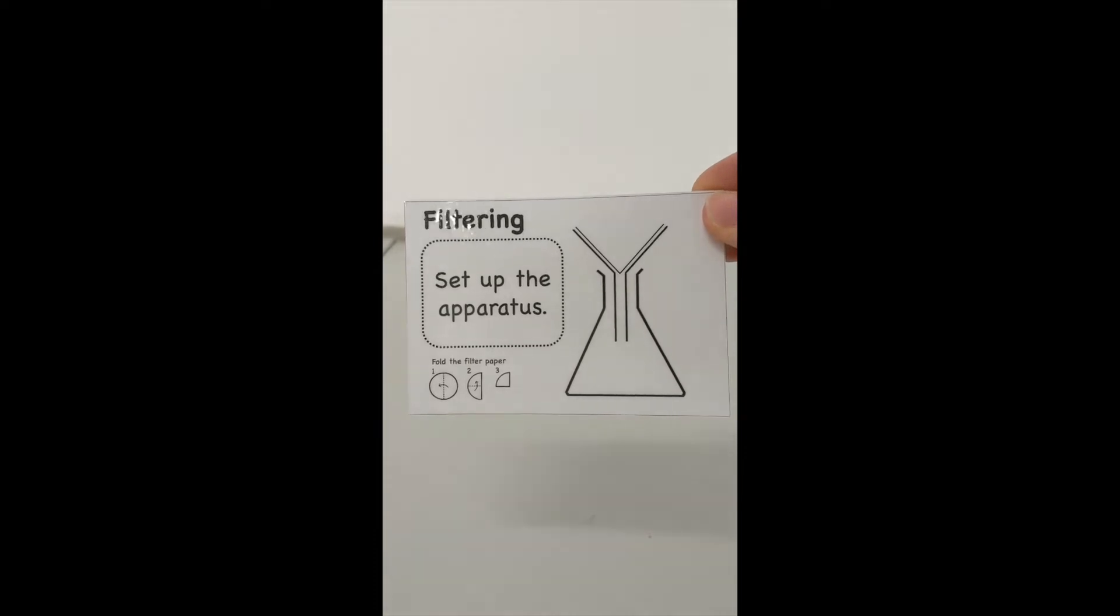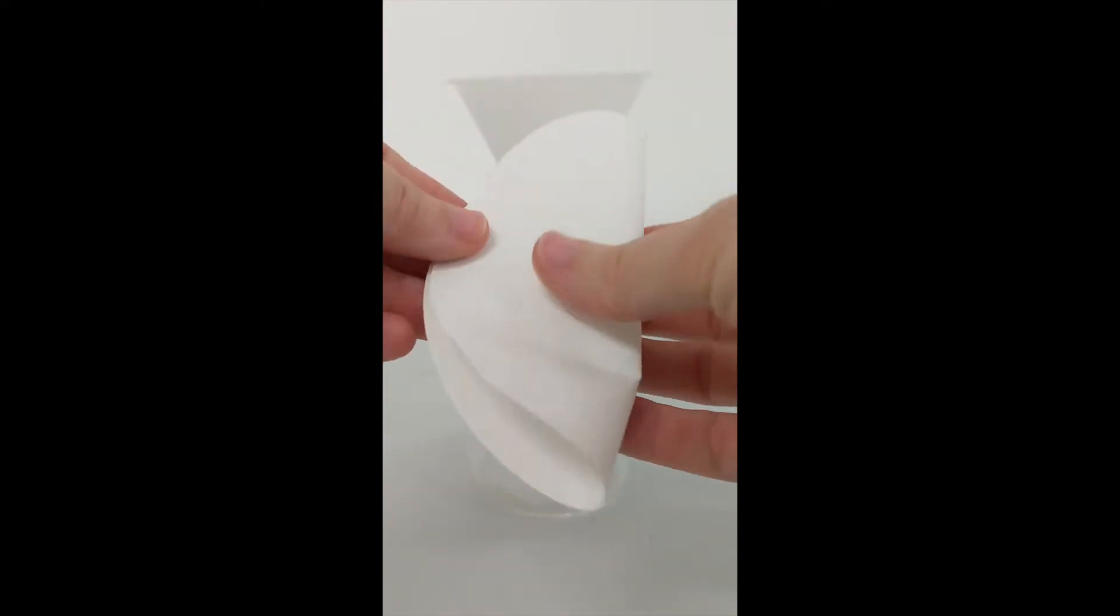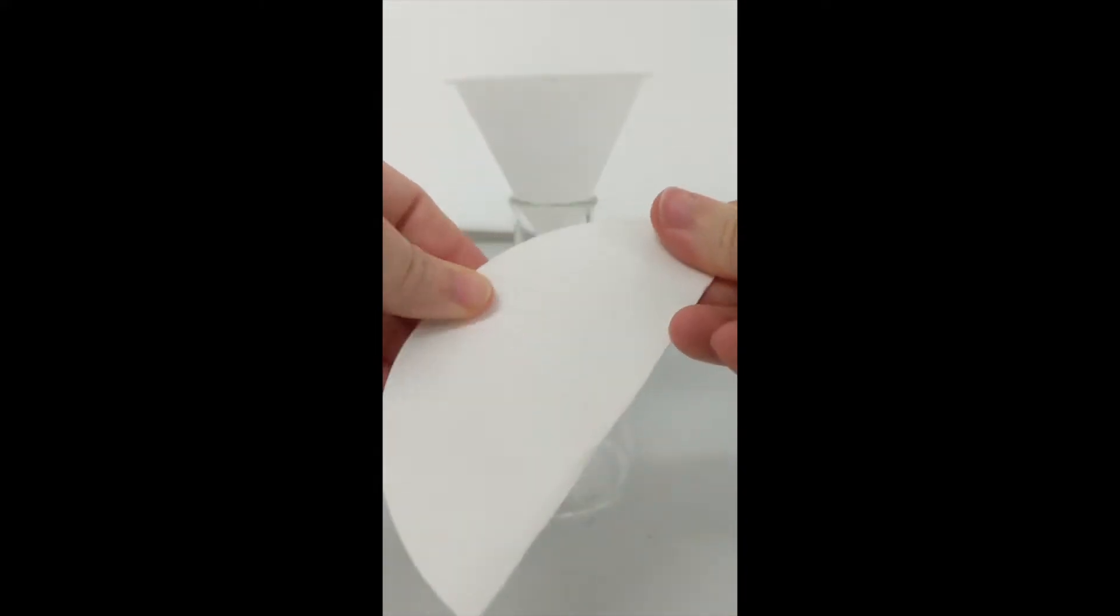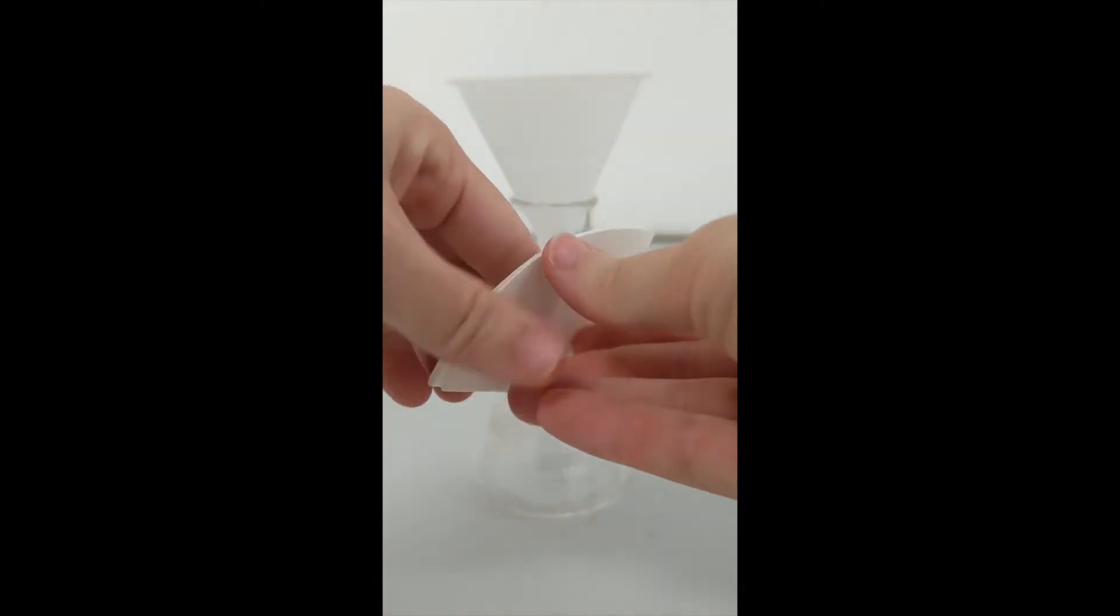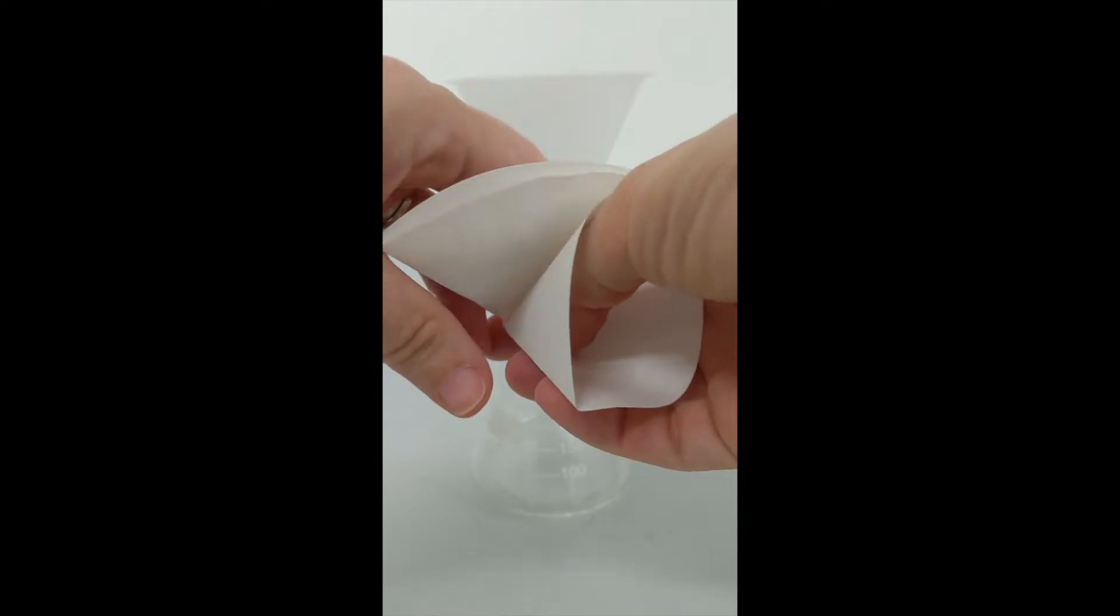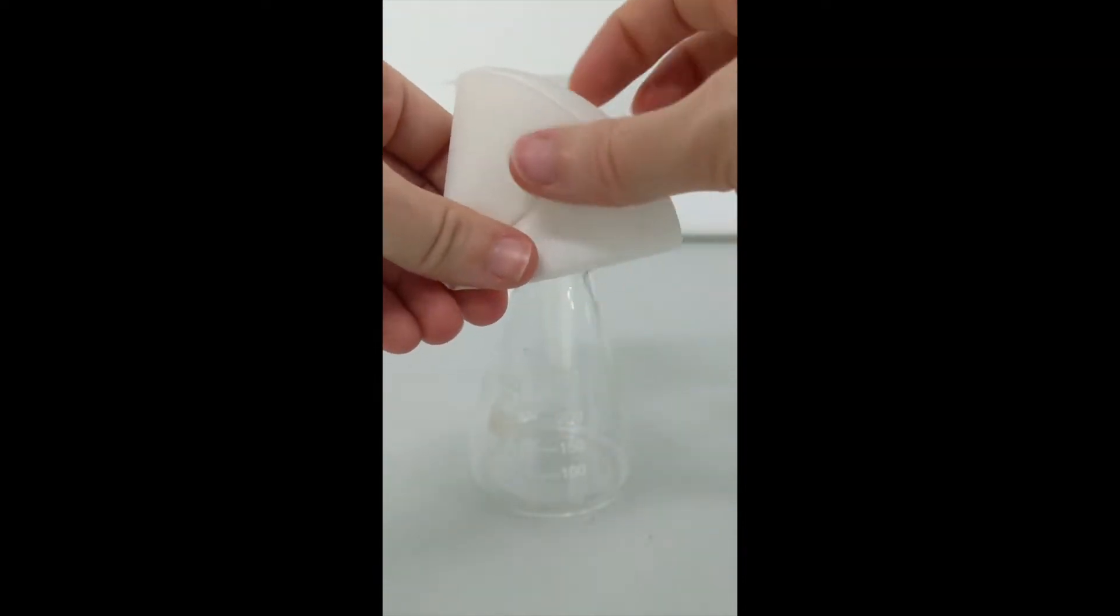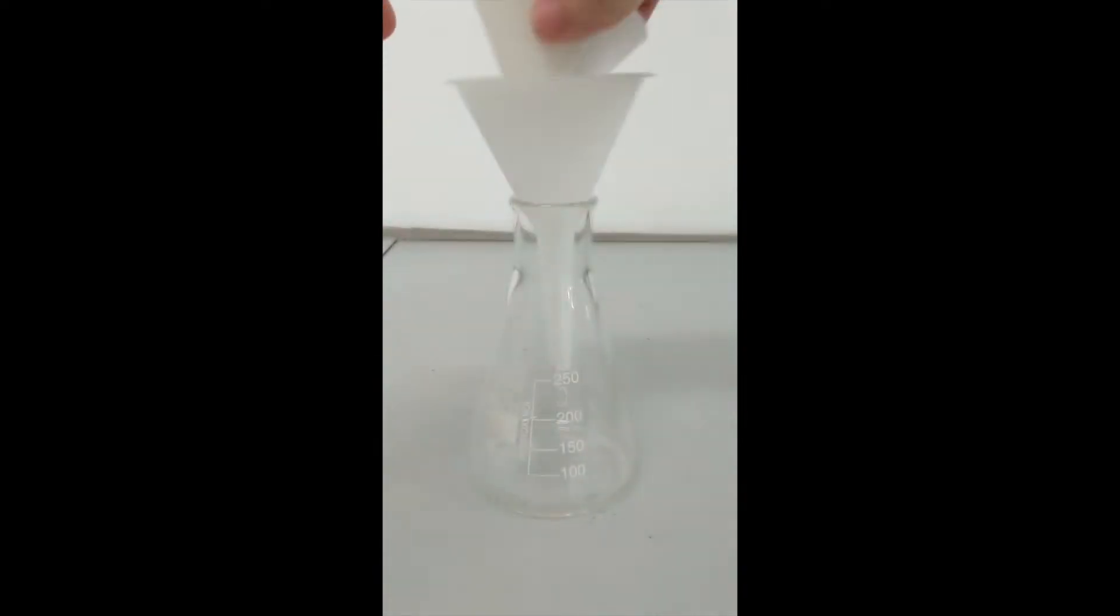Next I'm going to set up my filtering apparatus. I need a conical flask, a filter funnel, and a piece of filter paper. I fold this in half, in half again, and then I take away one side from three to make a nice little cone. That goes inside my filter funnel.